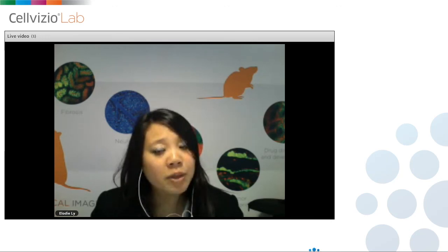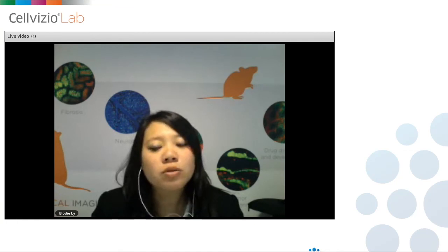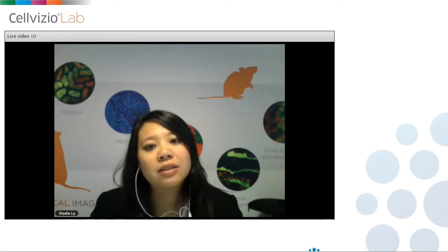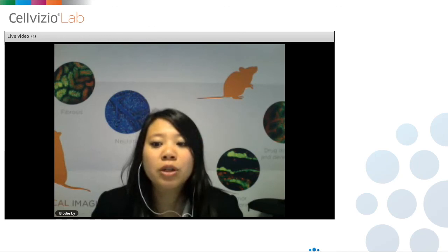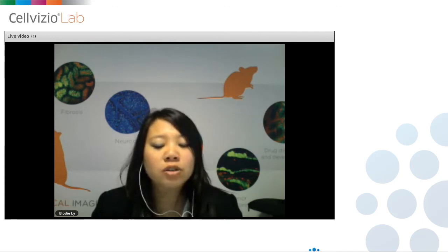We have different sets of microprobes. Some will look only at the surface, so from the point of contact, from 0 to 15 microns, let's say. These are surface probes. And to look at deeper areas, we have the Z probes. The Z probe would look at, let's say, roughly 150 microns from the point of contact. So you need to touch the Z probe with the tissue, and what you will image is underneath, more than 100 microns from the point of contact.